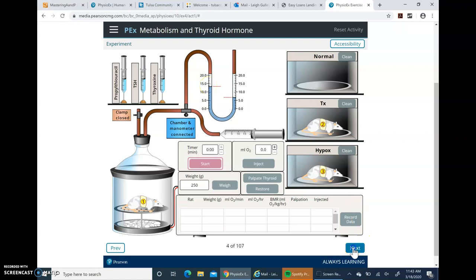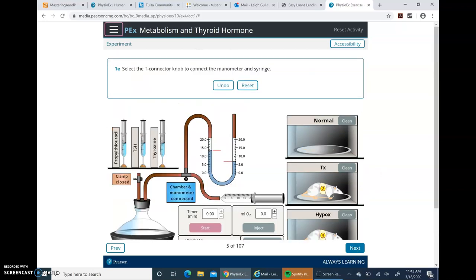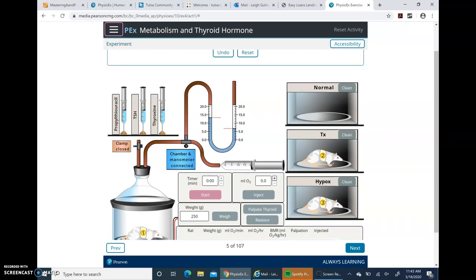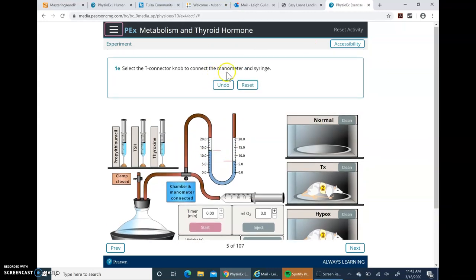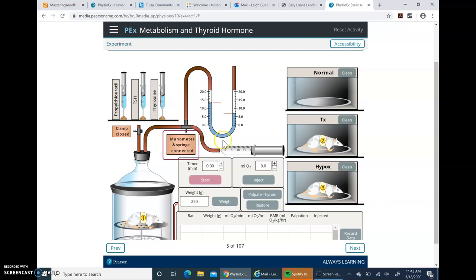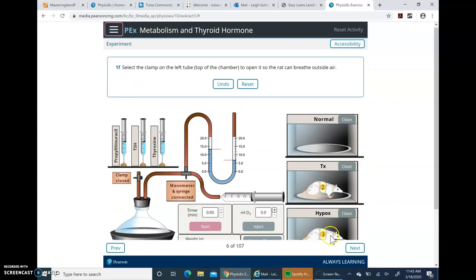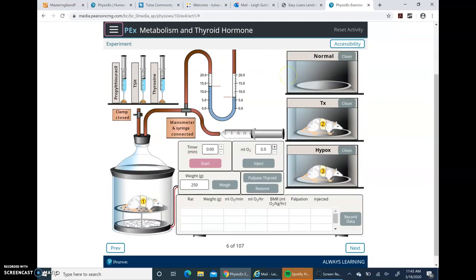It says select the T-connector knob to connect the manometer and the syringe. This is the T-connector knob — it kind of looks like the letter T. Right now the chamber and the manometer are connected, but it wants us to connect the manometer and the syringe. We're going to click this, and now the syringe is connected to the manometer. Then click Next.